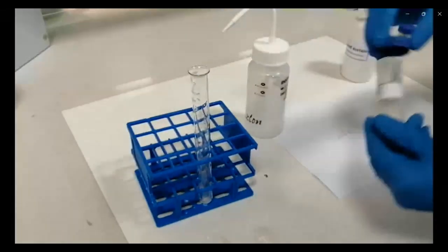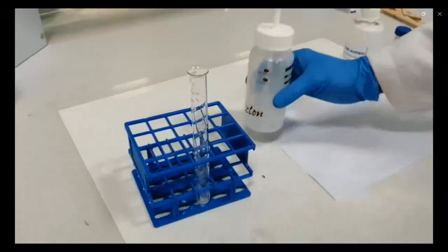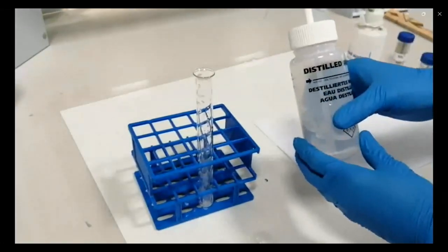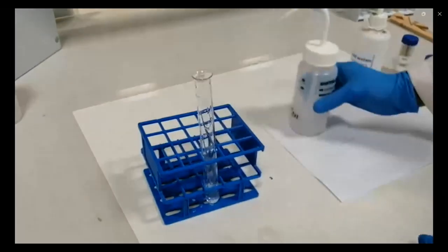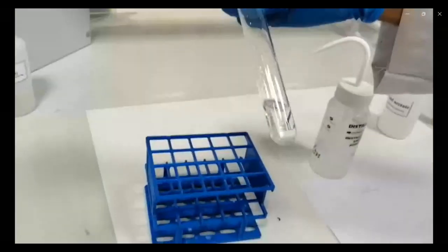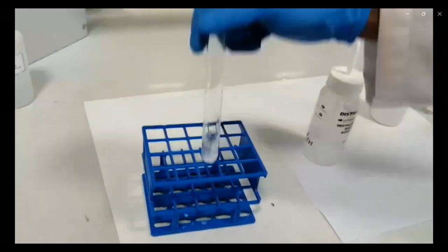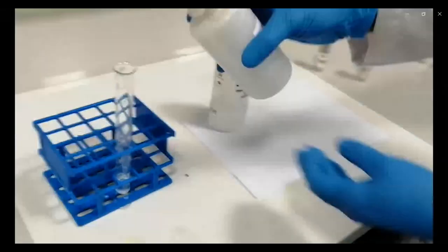In case of phosphate, PO4 3-, prepare a solution first by mixing water with the salt. Then add the lead acetate to the solution you have already prepared.